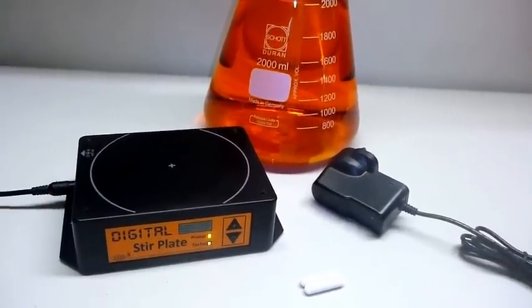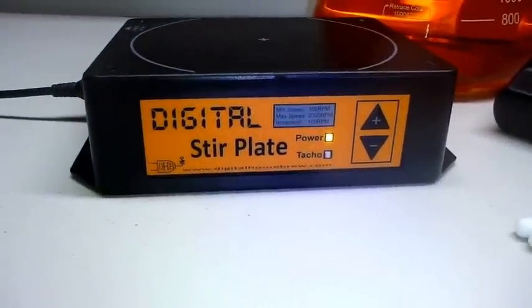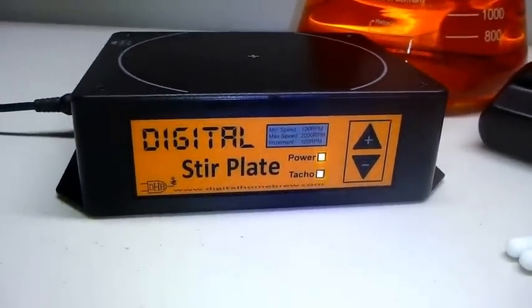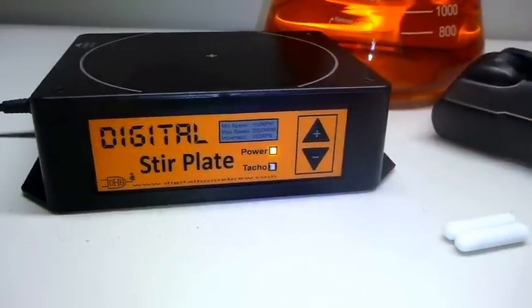Hi, it's Michael here from digitalhomebrew.com and I just wanted to introduce you to our newest digital stir plates. We've just conducted a second production run and we've managed to squeeze in a few extra features, so I'd like to detail them throughout this video.